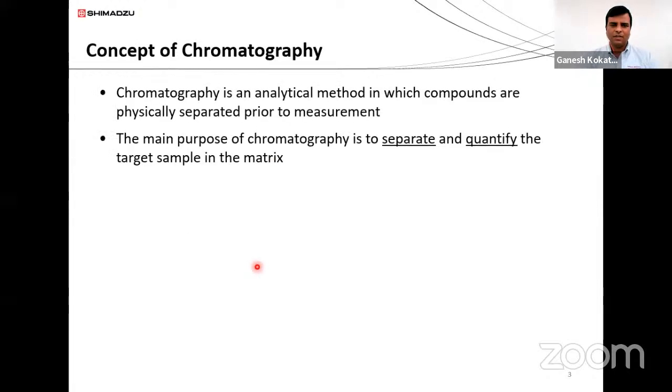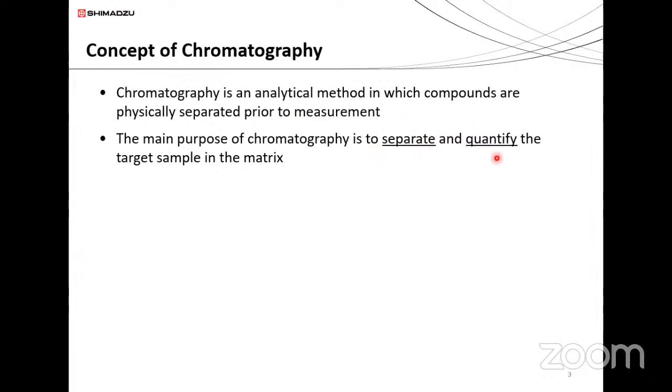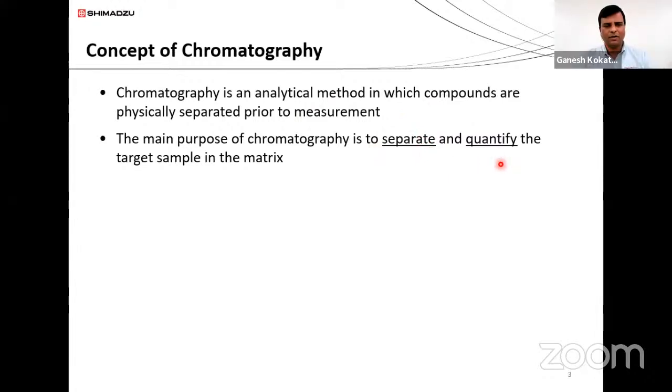Everybody knows about the concept of HPLC. In this session, we will cover the different terminology and the basic concepts of chromatography. I also attended the previous session, where sir explained the concept of separation and everything. I'm really glad to have that session as well today. In chromatography, as an analytical method, we need to separate and quantify any targeted molecule or sample from the matrix, and that is the main purpose of chromatography.